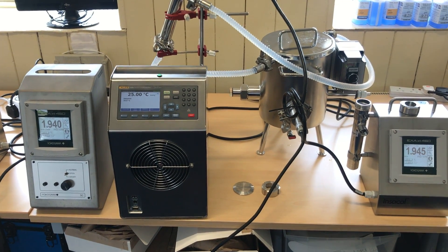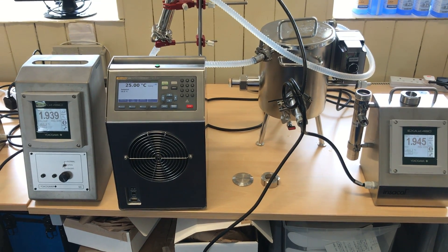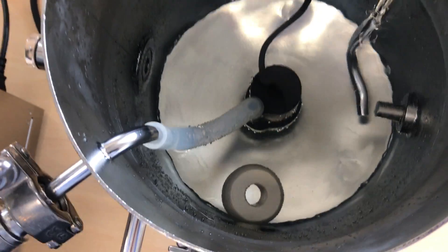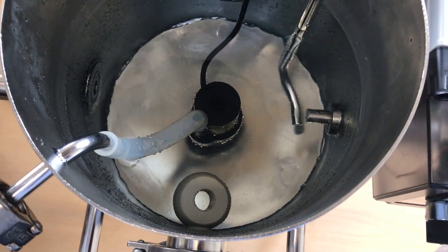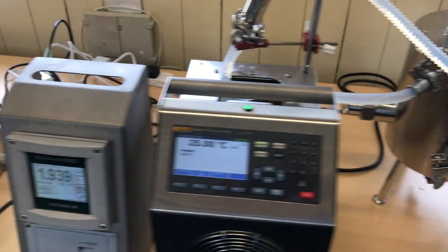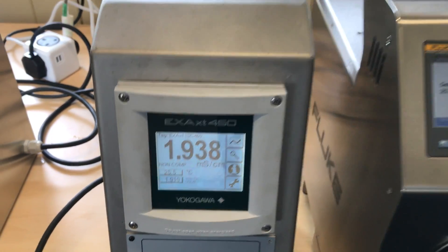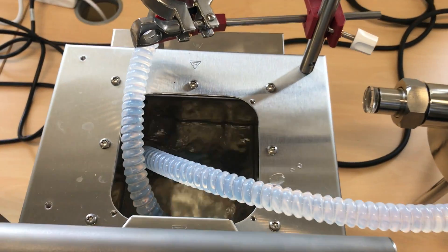Today we're going to calibrate a Yokogawa inductive conductivity sensor, including its temperature sensor, at a controlled temperature. The sensor is installed as it would be in the process in our T9 INSECAL recirculation tank, and its transmitter is here with both non-compensated and compensated values displayed on the screen. We're using the Fluke 7109 bath to control the temperature through both systems.